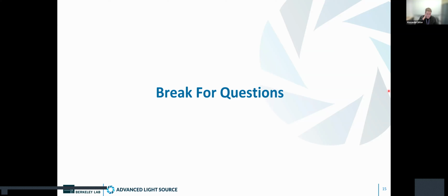Yeah, so I think there are two things that help with this. One is more flux. When we're at ALS-U, we're hoping to push the boundaries for how fine a resolution we can get, because the coherent flux is what gives you the scattering, and that is what ultimately sets your resolution. The other thing is you can bring the detector closer, or essentially you're measuring a wider angular range with your detector.